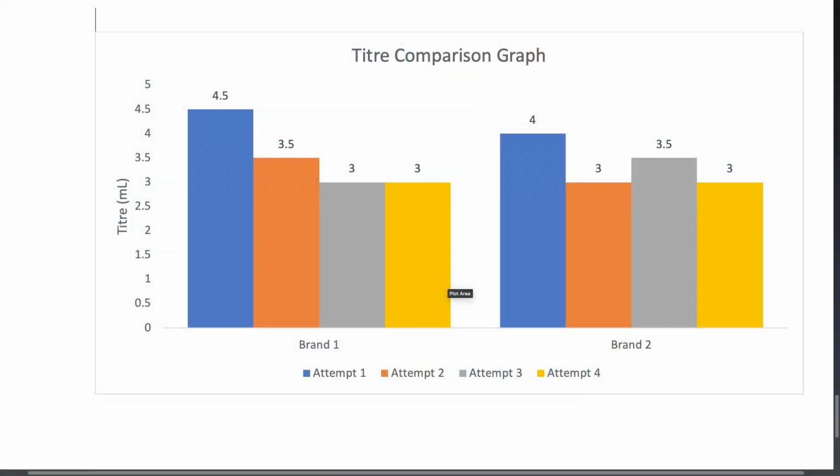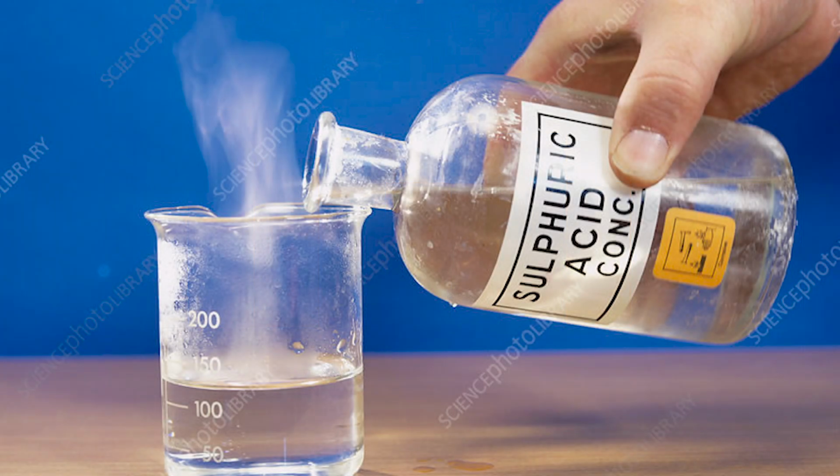As seen from the graphs, the first attempt in both titrations seems to be off by a little compared to the others, most likely due to being the rough titration and me not knowing what mark the endpoint would occur at. After the first attempt, I was able to quickly skip to that mark and titrate slowly to get an accurate result. An issue that was discovered was the concentration of sulfuric acid being too strong to titrate initially, as I overlooked a small detail accidentally. To fix this, I simply just diluted the solution by a tenth to make it easier to titrate.